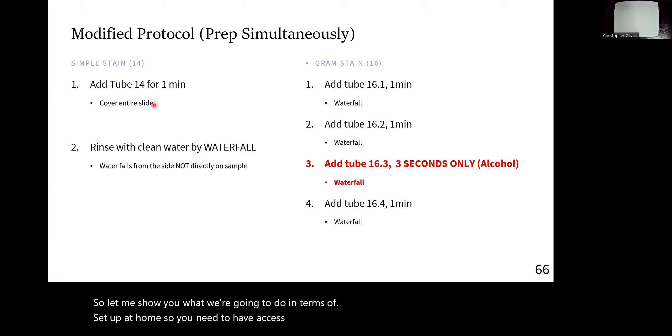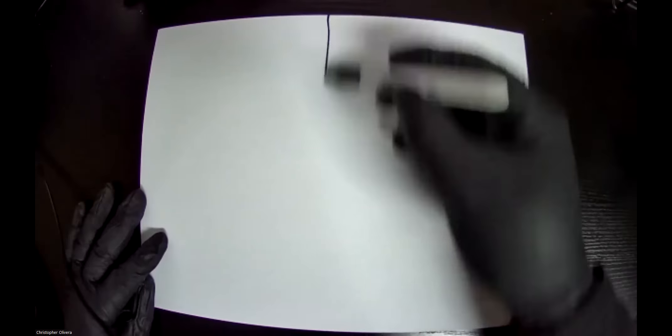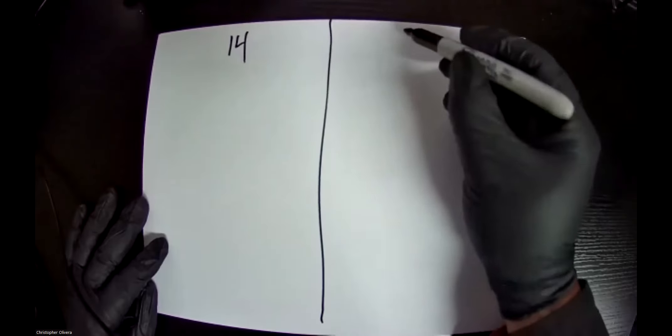Let me show you what we're going to do in terms of setup at home. You should now be able to see my full bench, which is basically my desk. I have a little piece of paper that I'm going to use as my setup — you should also have sharpies or pencils. I'll divide it quickly: lab 14 on my left and lab 16 on my right. Get used to setting up your own little benches this way.